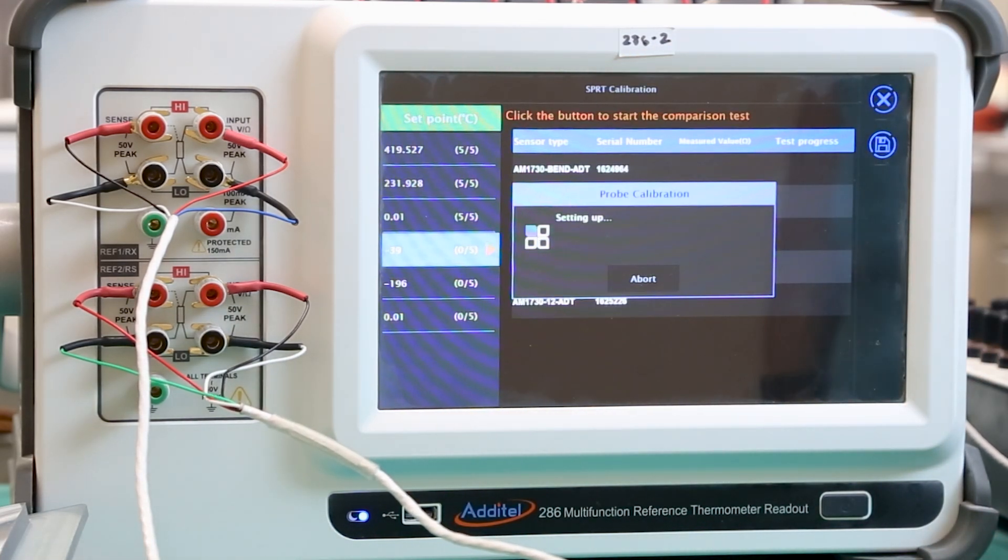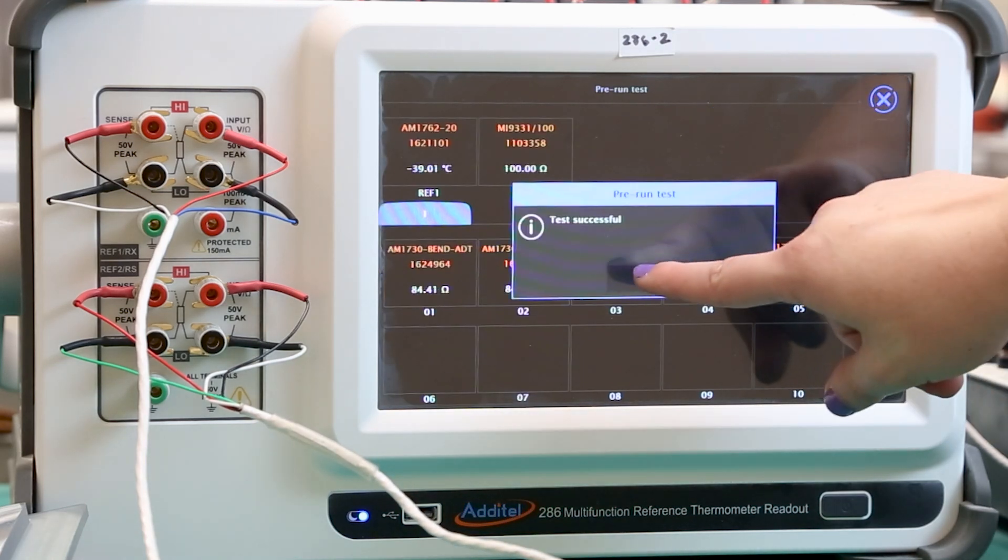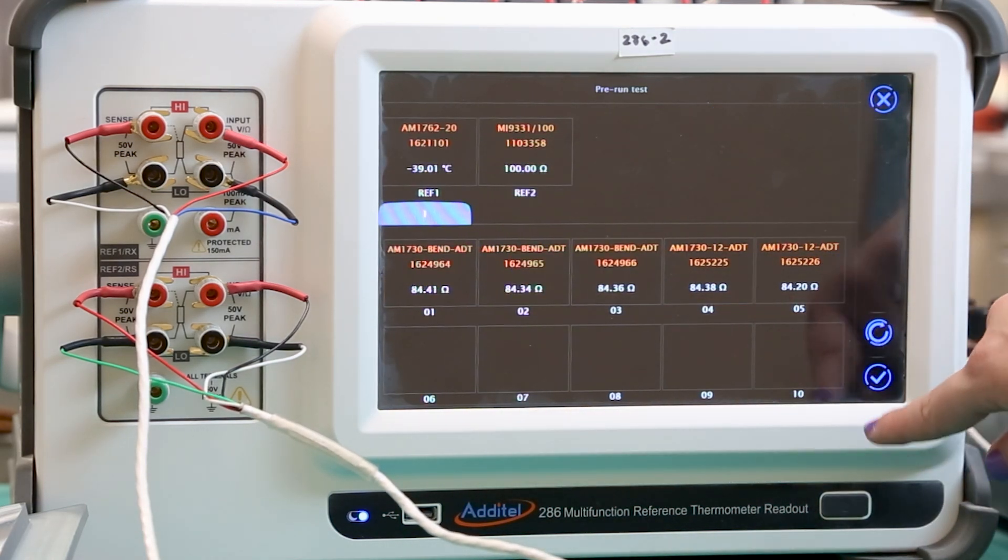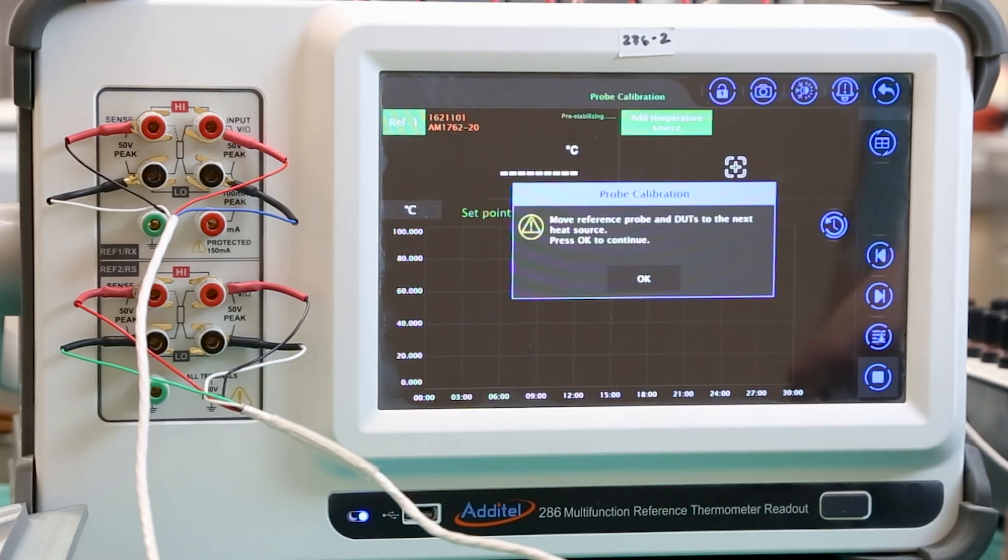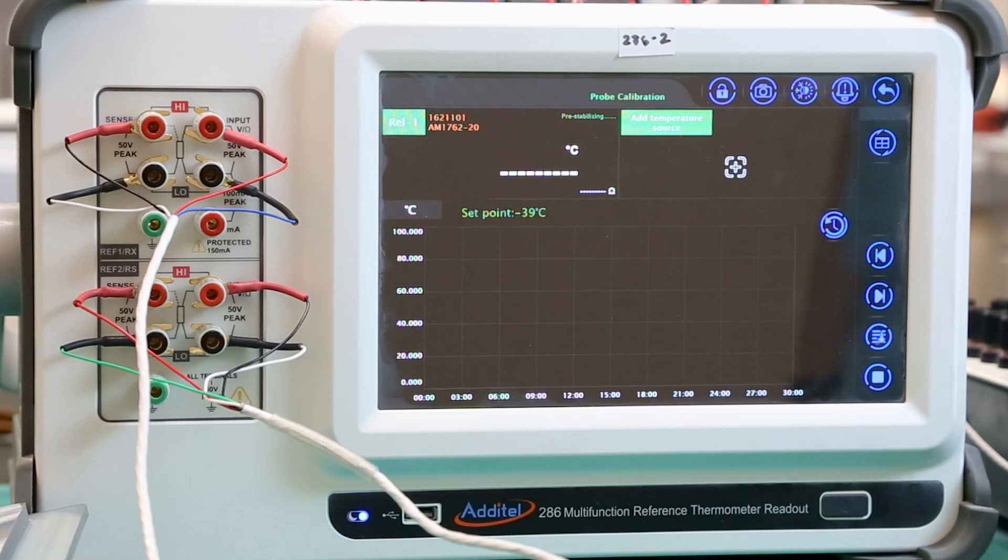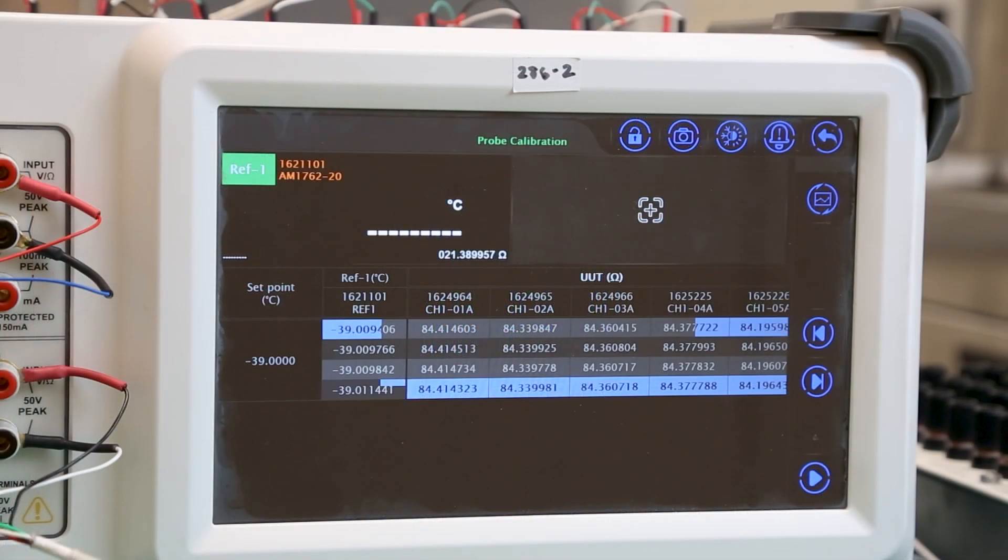Press the next button again once finished. The 286 will now test each probe signal to ensure that they are working correctly. After that, press OK and the check mark in the bottom right corner to move to the next section. Once you select the play button in the bottom right corner, the test will begin. This portion of the test is fully automated and will end with a pop-up window once all probes have been measured according to the test settings.